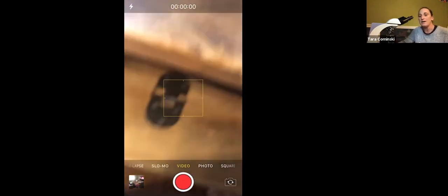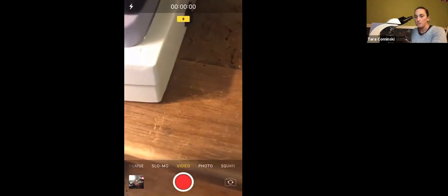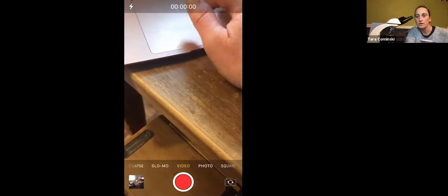So now I'm going to focus it a little bit better using this coarse focus here, okay? I hope this is showing you guys. Should be fine.